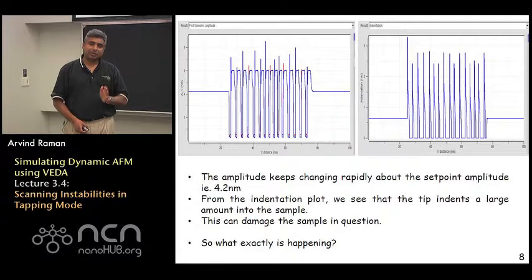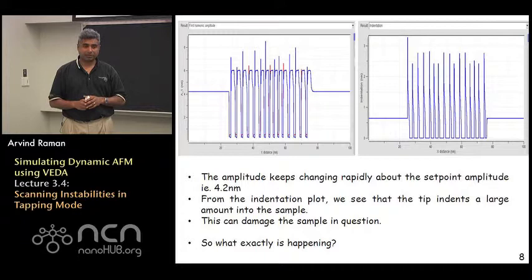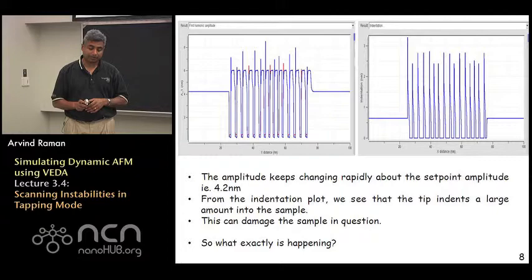The question is what is exactly happening? We have tried changing the integral gain and that did not seem to help us. What we might want to do in such a situation is to do another experiment. If the scanning experiment is not really working out and there are instabilities, we do not seem to figure out why it is happening. Our recommendation is always to go to a dynamic approach curve. What we would do now is go and choose the basic dynamic approach curves tool and perform with the same conditions an approach curve on the substrate material and another one on the feature material.